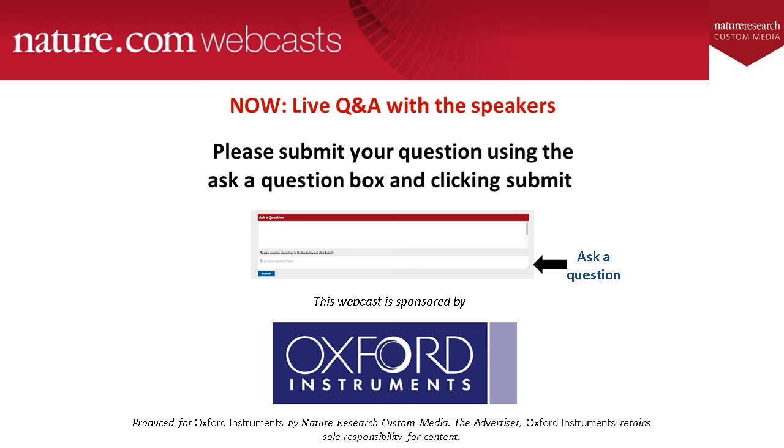I think I showed you in the presentation some macrophages, and they were on a cover slip that didn't have any special coating on, but there wouldn't be a problem incorporating a gold coating into that to help the cells adhere to it. Plus, it would have the advantage of making the substrate much more conductive. So the answer to the question is yes, it is possible.